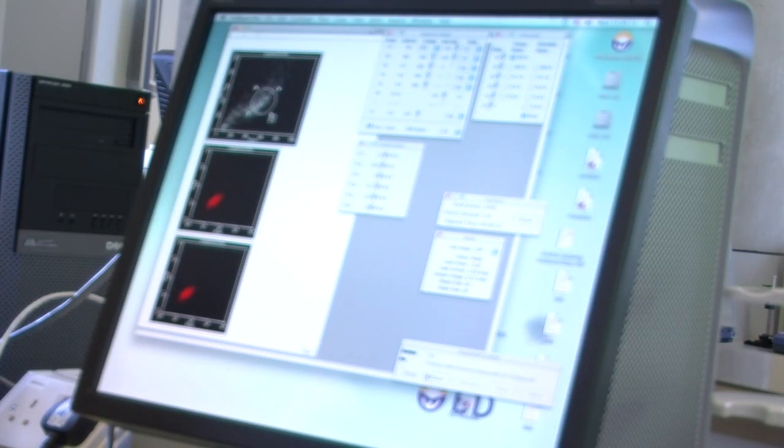And what I would say is, if you're running flow cytometry, try not to get too excited by what you see on the screen, because when you come and analyse it and you apply the gate properly, bear in mind we haven't got a proper gate up here at the moment. So our red plots are not absolutely representative of what our data will be. It's very much a quick look. We're quickly assessing our data.